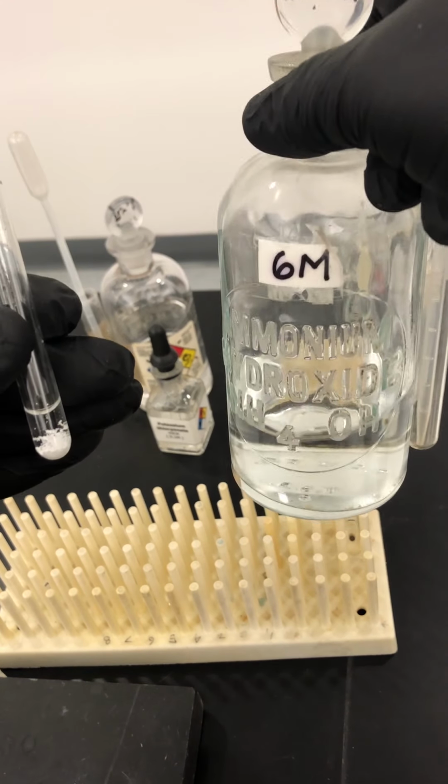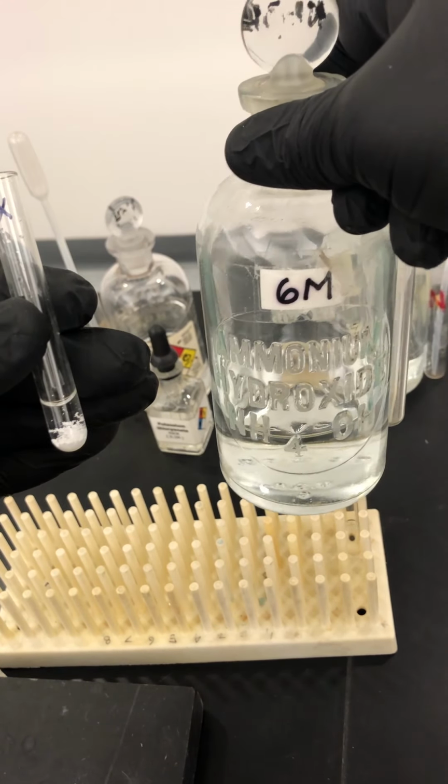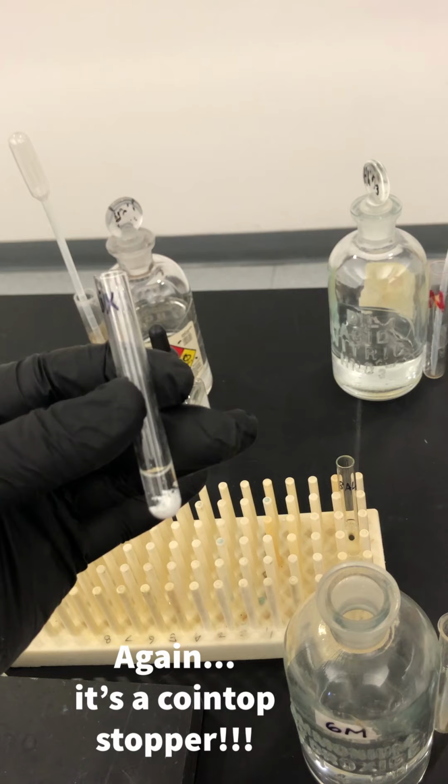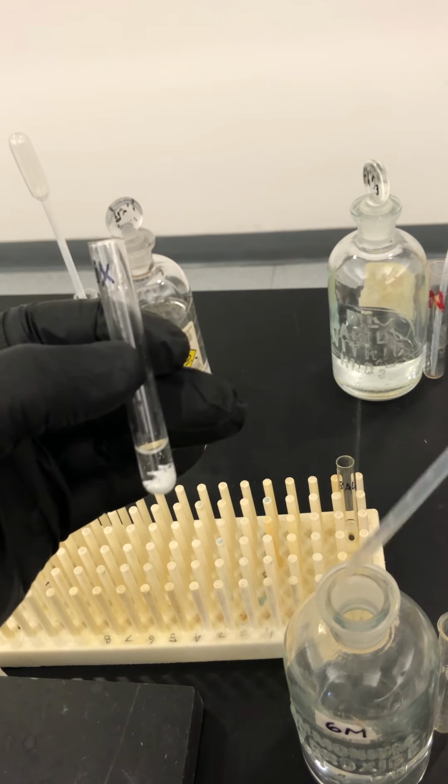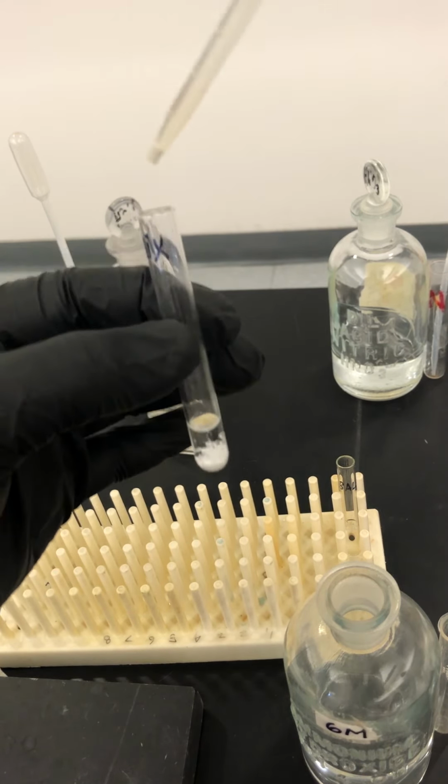But remember, in solution, ammonia becomes ammonium hydroxide. So let me open this. Again, hold the coin stopper top with your fingers. I'm going to bring some of this and add about 15 drops of this into my solution.